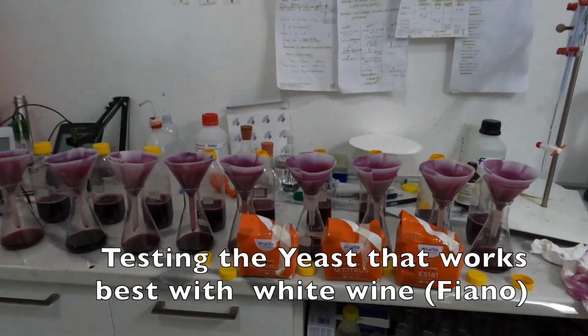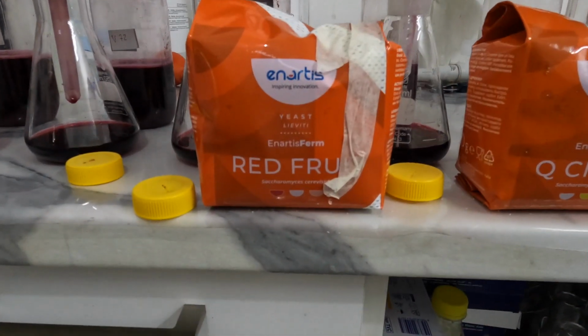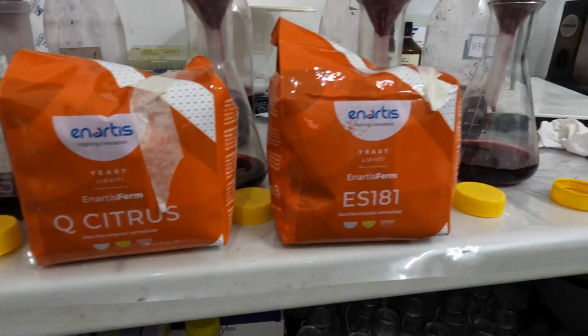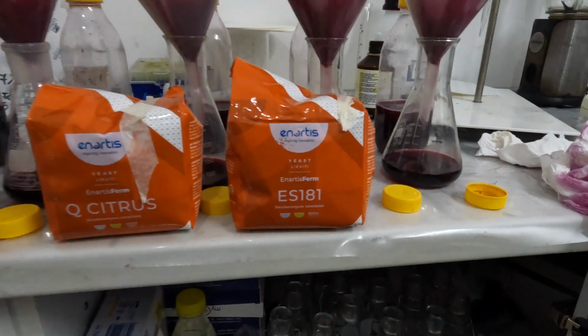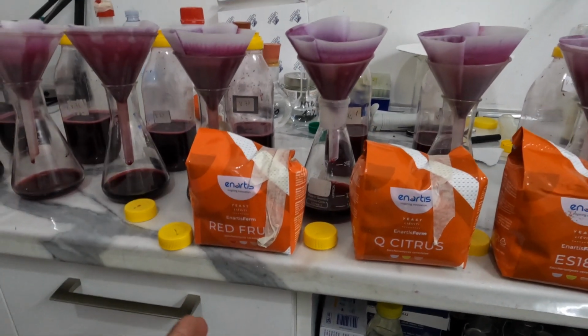All right, so he's actually testing 3 different types of yeast, and you can see the names on there. So Rocco, tell me, what would you use this for?